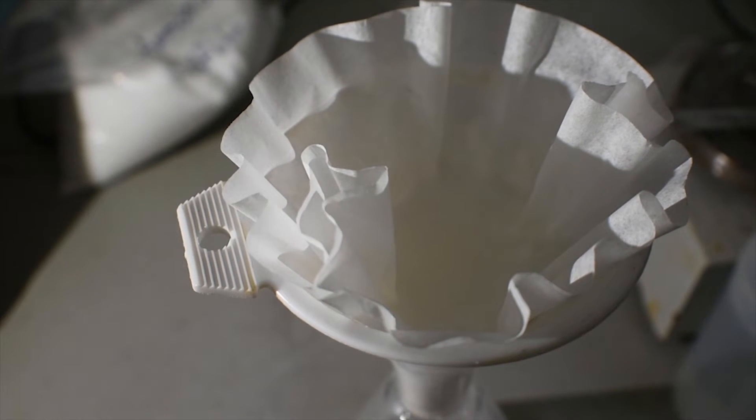Then wash out the reaction flask or reaction container with a little bit of methanol. This will be used to wash the product as well.